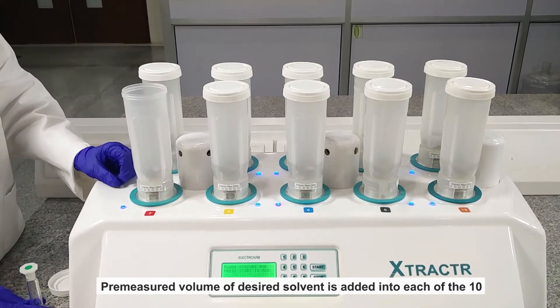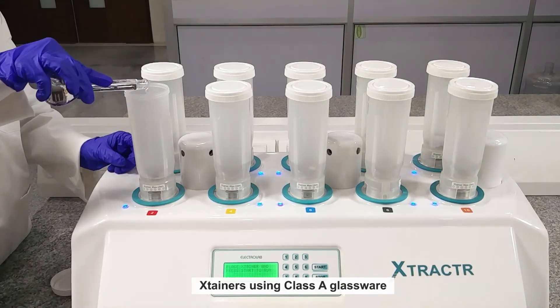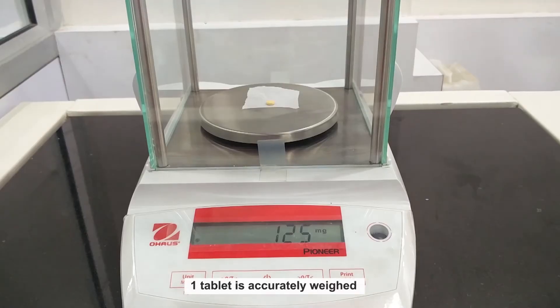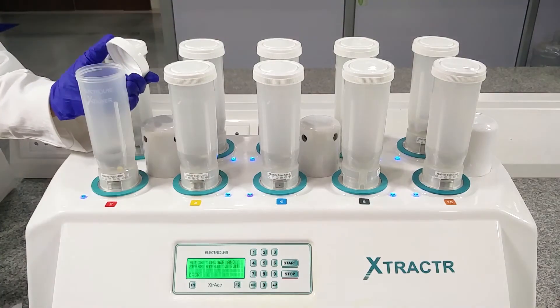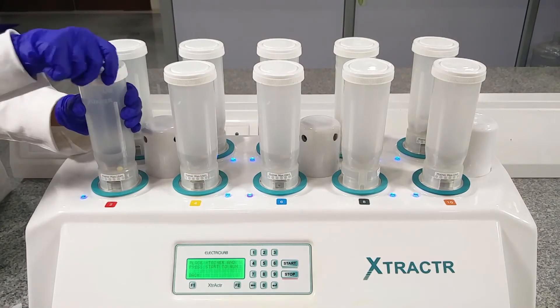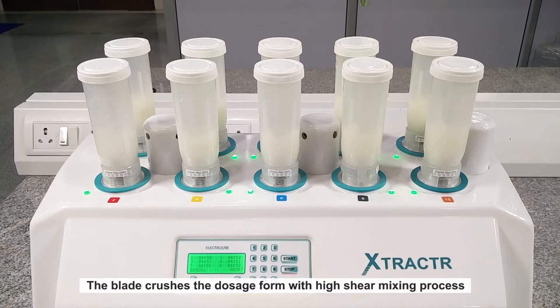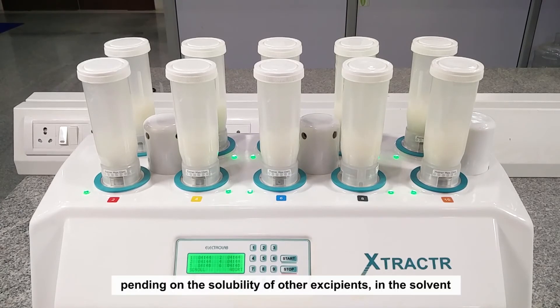A pre-measured volume of the desired solvent is added into each of the 10 Extainers using Class A glassware. One tablet is accurately weighed and added to each Extainer. The blade crushes the dosage form with a high shear mixing process and can form either a dispersion or a clear solution, depending on the solubility of the excipients in the solvent.